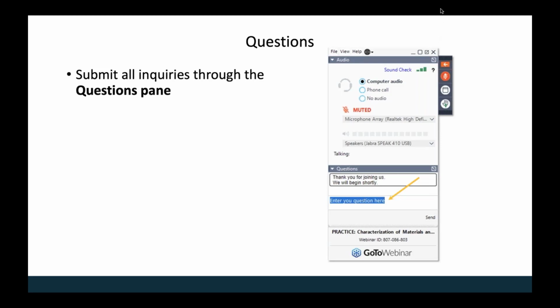And I still don't think it'll happen because you need a human to fix any errors that happen. So if I may add a little bit, the experiment that I showed at the beginning of the presentation, where we were doing 4D-STEM, EELS, EDS, and a heating experiment, that was Python scripted, so that was collected overnight, automatically controlling the temperature on the holder because the holder is integrated in Digital Micrograph, and then switching modes on the filter between STEM and EELS mode and collecting spectrum image datasets at each point.